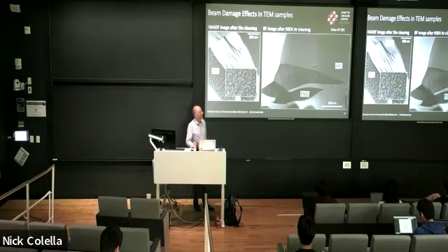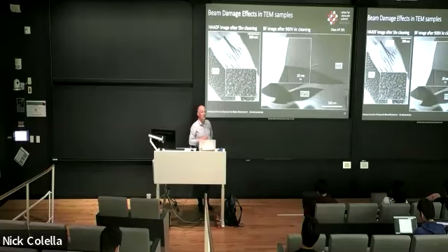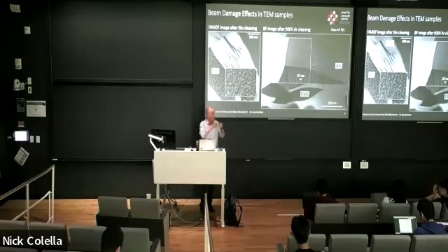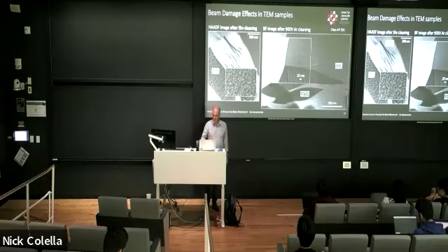And this is the actual structure as it actually looks like. You can see now beautiful tiny precipitates in the material that were completely obscured by the mottled defect structure that the gallium implantation has generated on the left side. So this is sort of the art of preparing good TEM samples. And so here I think we have all the necessary tools to prepare whatever sample you need with very high quality.